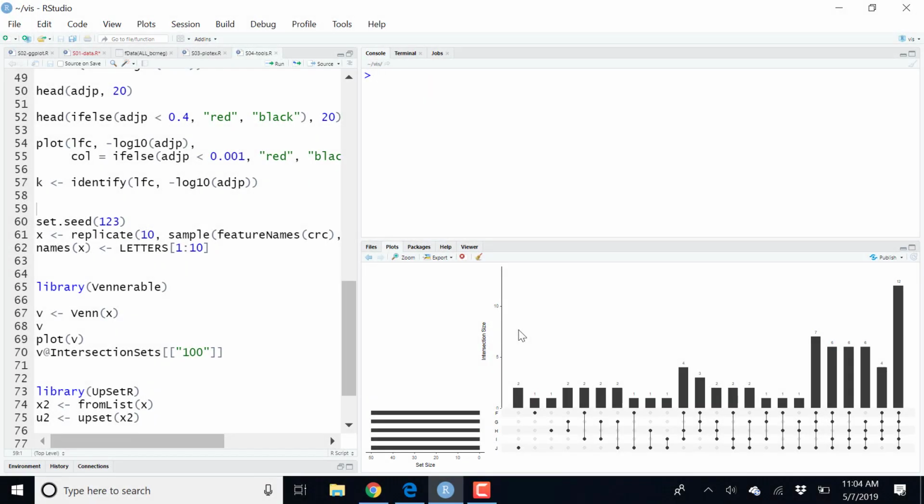Okay, so let's continue, and let's start now to learn about some unsupervised machine learning methods, and we'll see hierarchical clustering, k-means, and principal component analysis, how we can use these on our biological data sets, again, to produce some visualizations, but the idea really is to understand the data and possibly calculate new metrics that we can then use to annotate additional normalizations or additional visualizations.